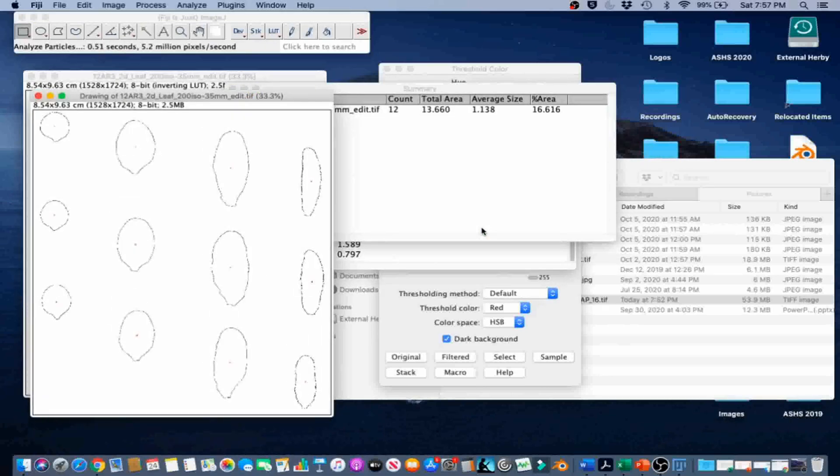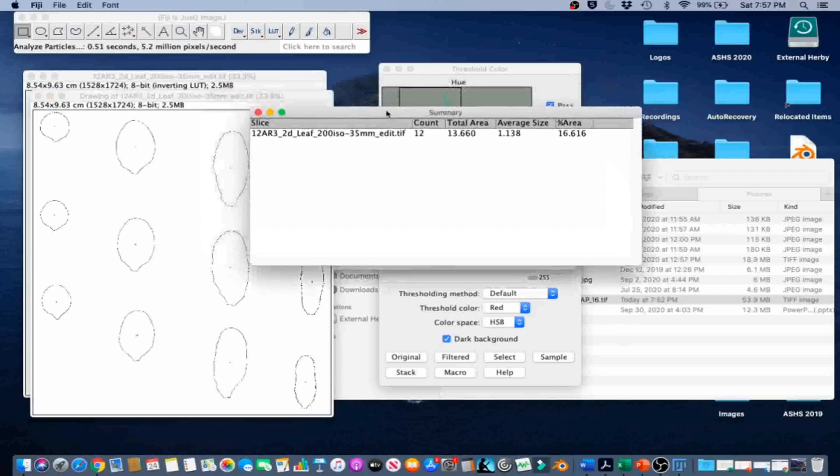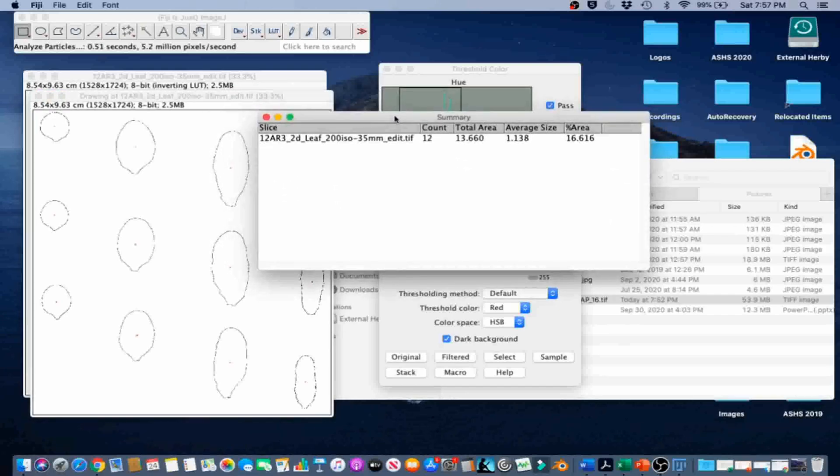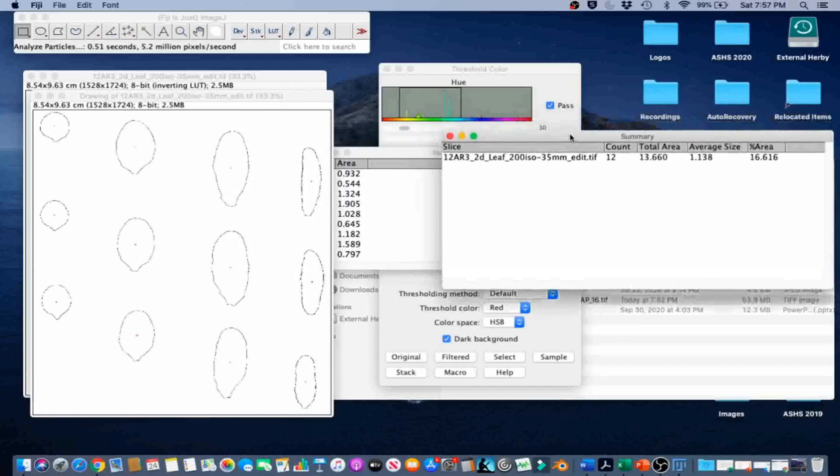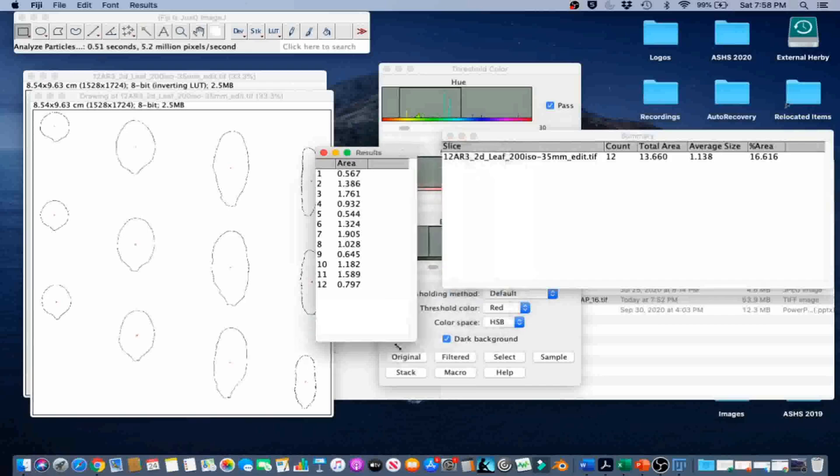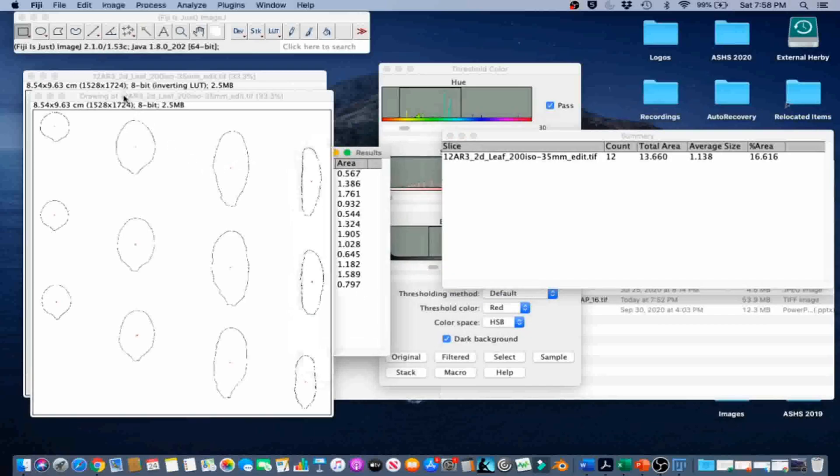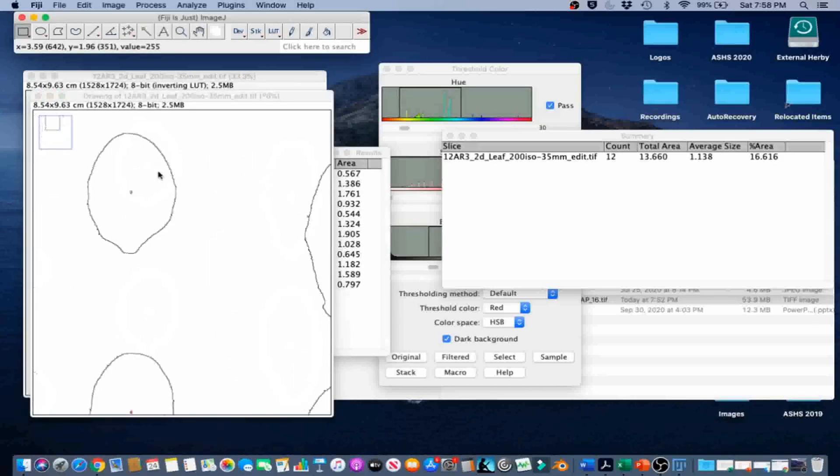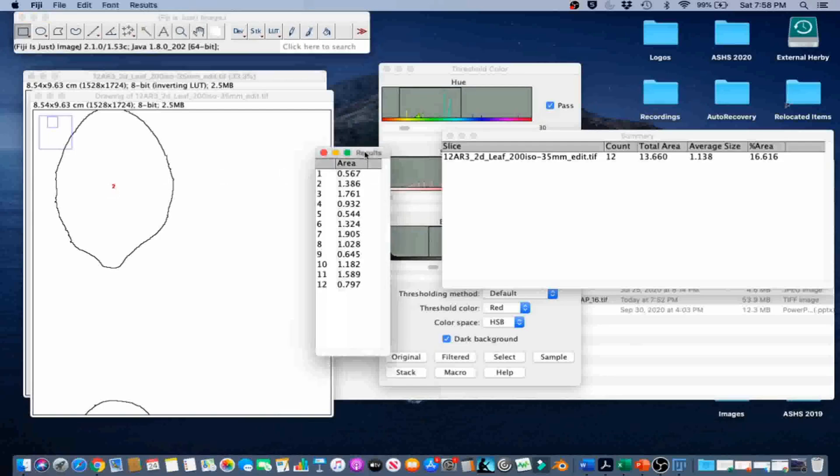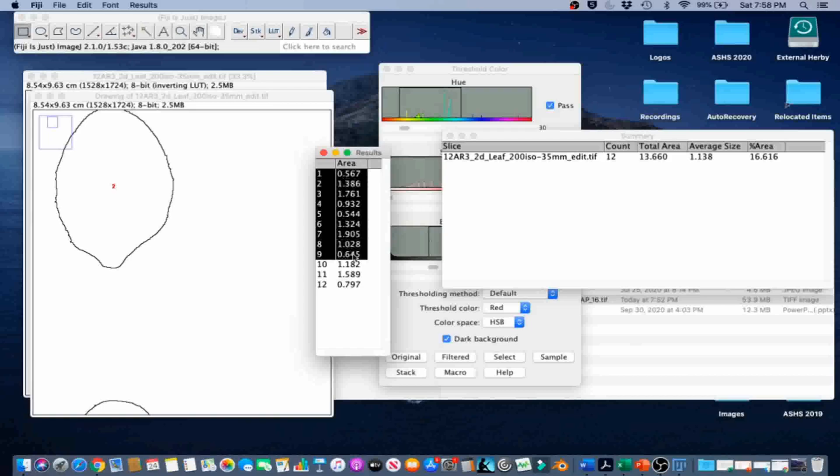Now we can record the desired information from the Summary and Results table. The Results table will have the area of each leaf. And if you scroll in on the image, each leaf is numbered based on the outline's output. So here we can go to Results and we can copy all of that and put it into Excel if we want to.